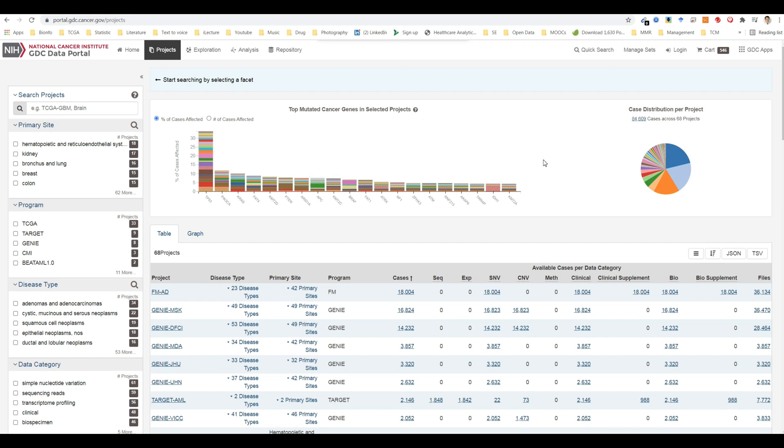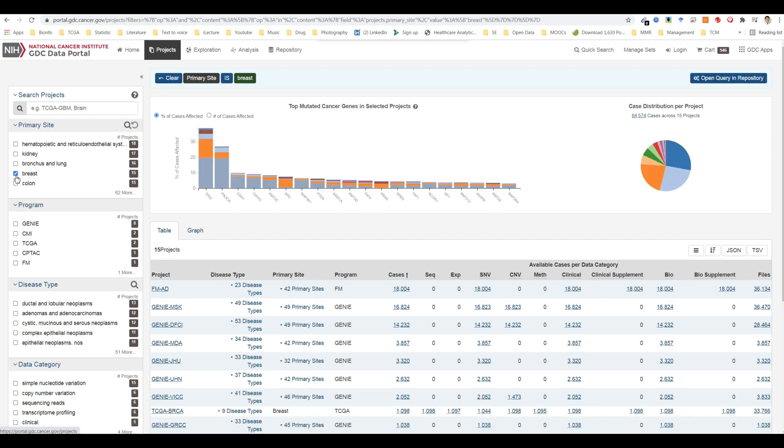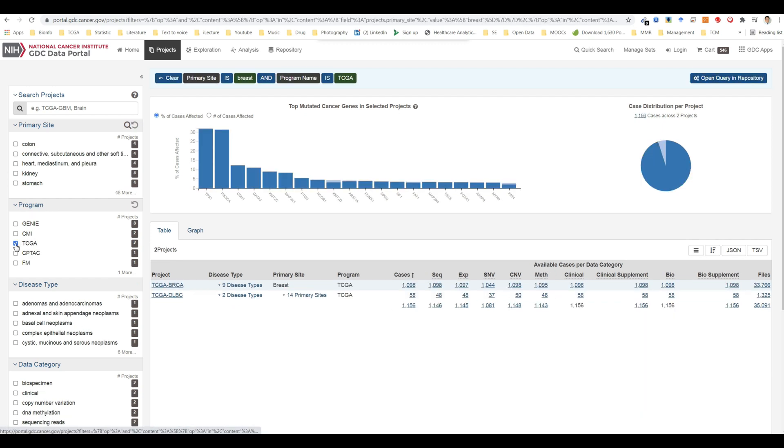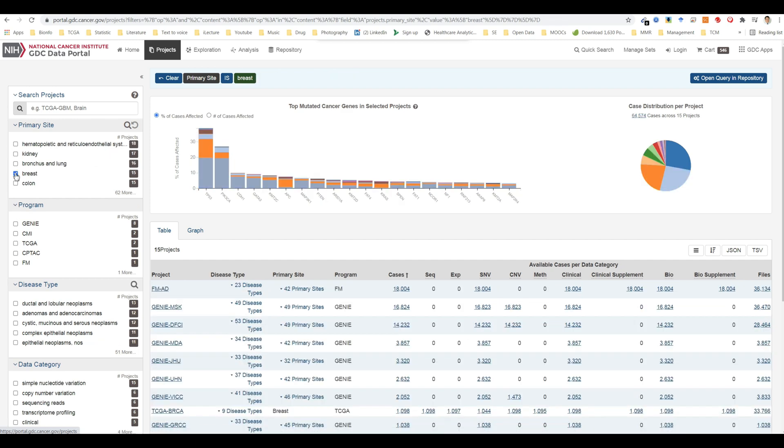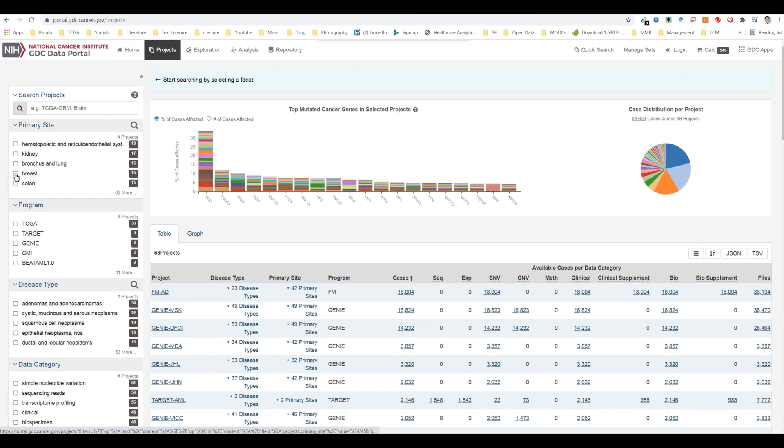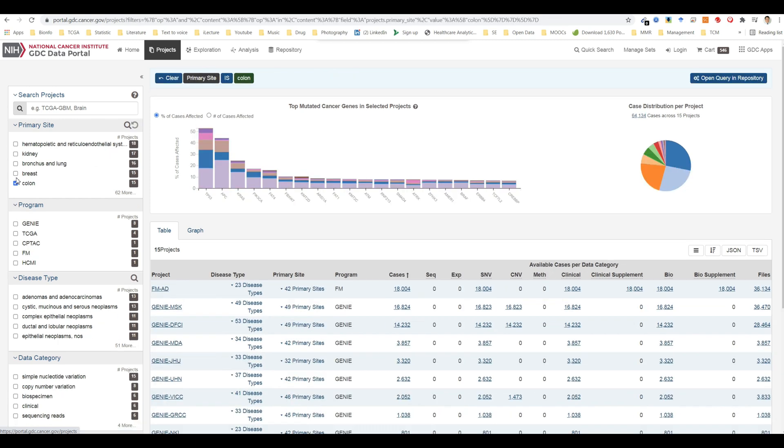On the left, a panel of facets allow users to apply filters to find projects of interest. When facet filters are applied, the table and visualizations on the right are updated to display only the matching projects. When no filters are applied, all projects are displayed.